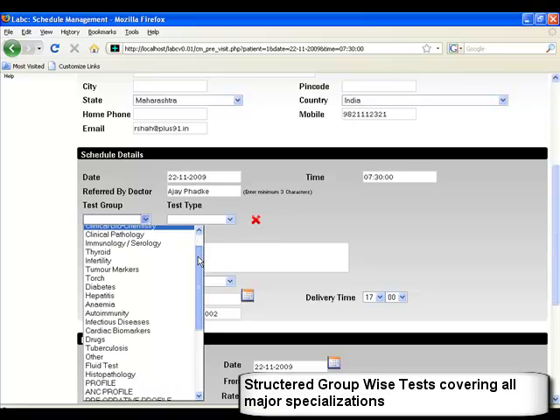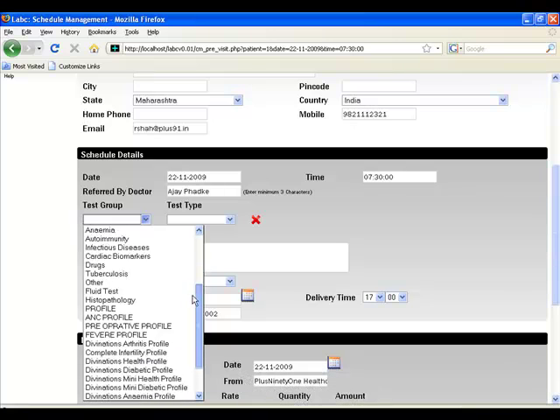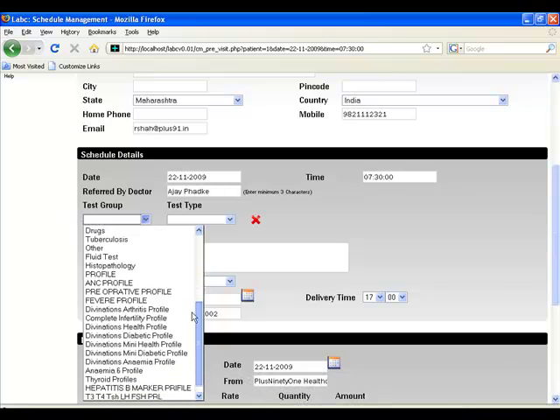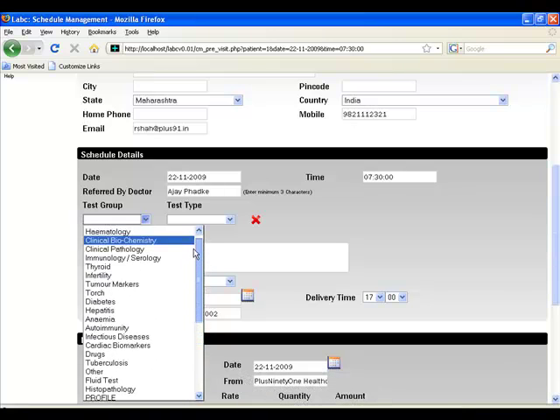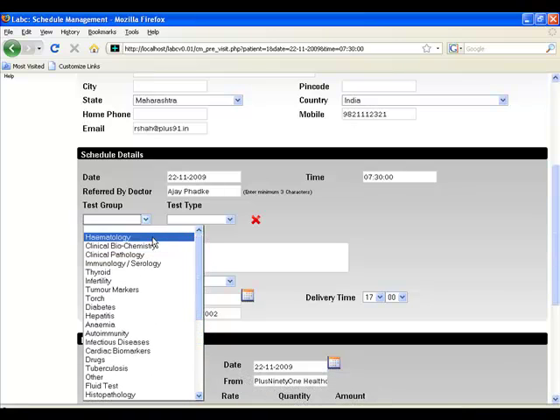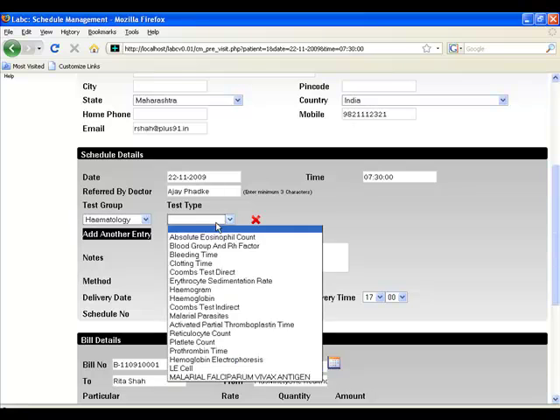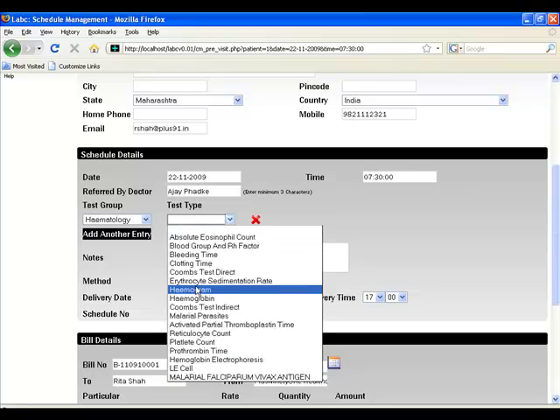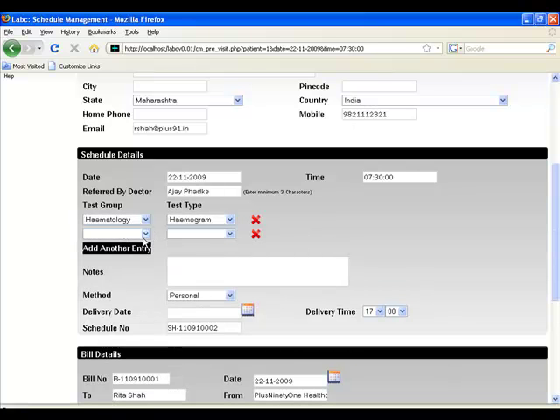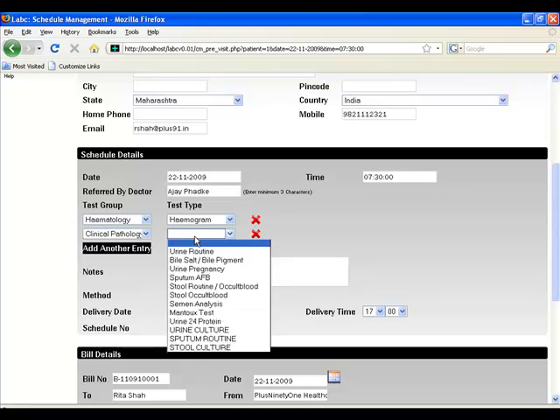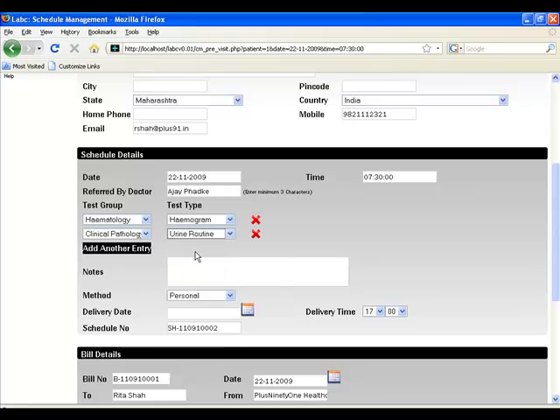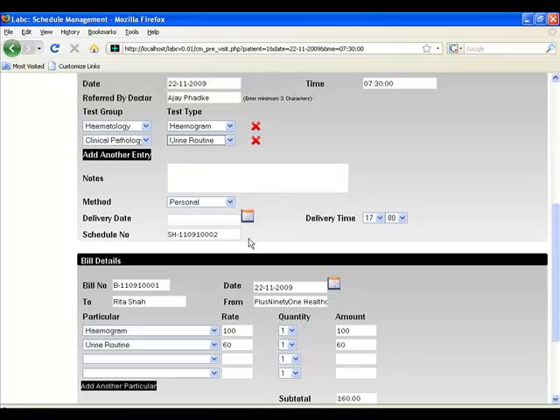All the tests have been bundled into various easy-to-find groups, which allows you to add tests quickly. You can also add multiple tests. You can also create profiles, which are a collection of tests. Tests and profiles can be created on the fly.